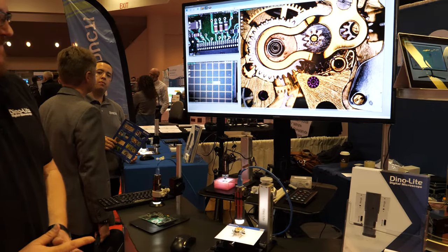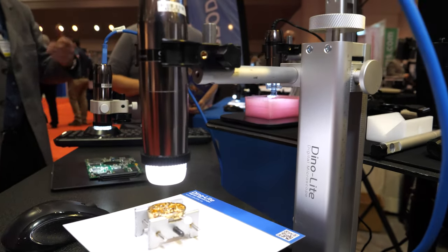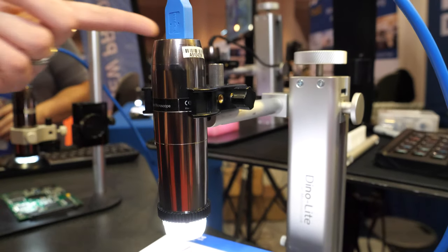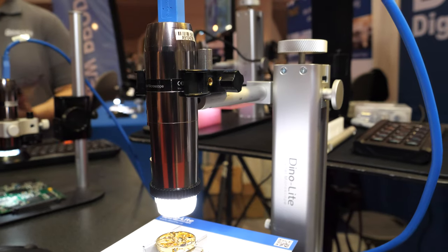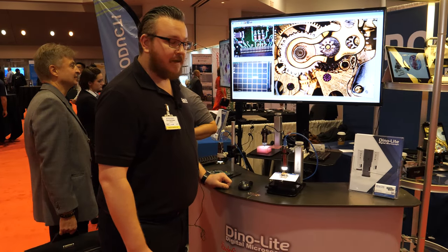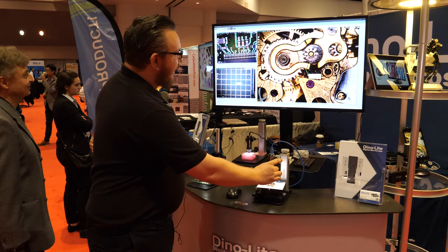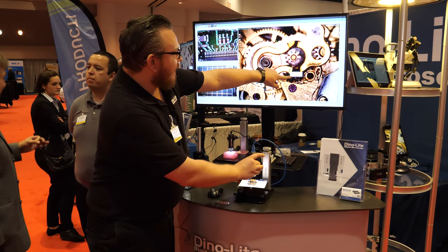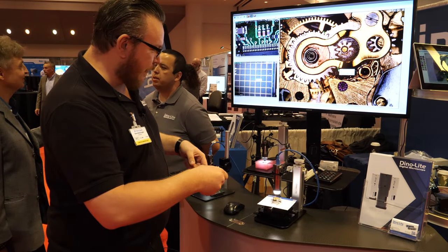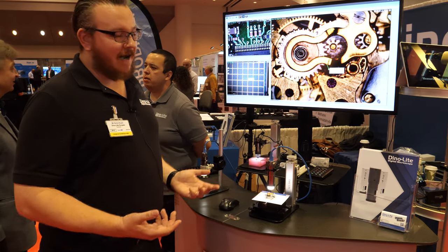Do you have this stuff for sale? Is it expensive? No, everything is really reasonably priced. Our most expensive product is this one at $1,400. This stand is one of over a hundred different stands and accessories that we have — this stand is $260, and everything is down from those price points. This model is USB 3.0 and 5 megapixel. It will auto-calibrate itself if you're doing measurements. So if I put down a measurement and turn the dial, it's going to automatically input the correct scale into the software. All I have to do is get it in focus and do my measurement.